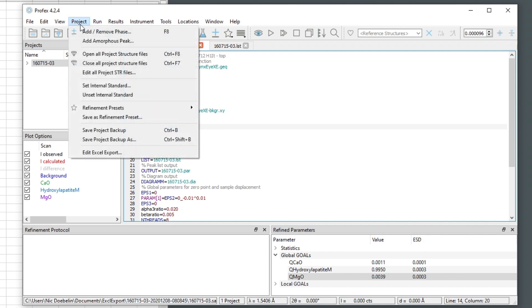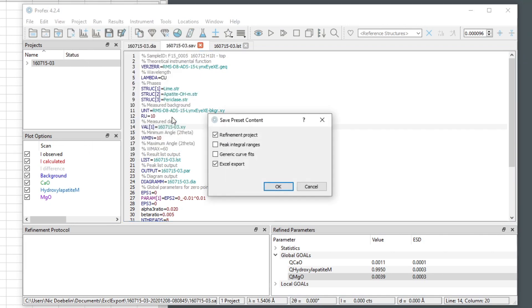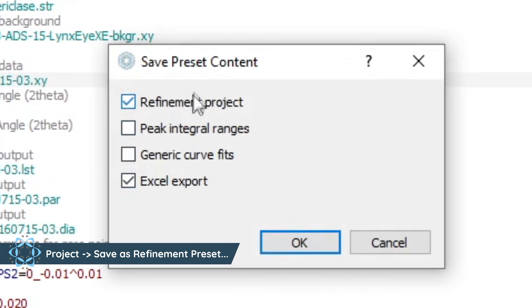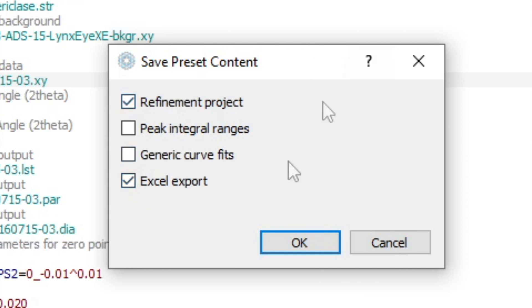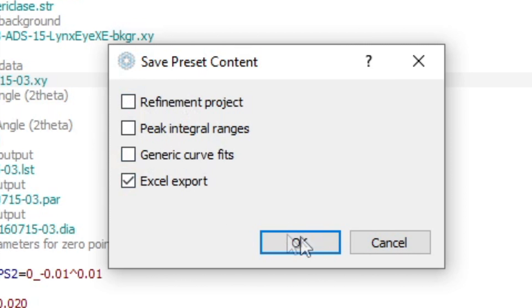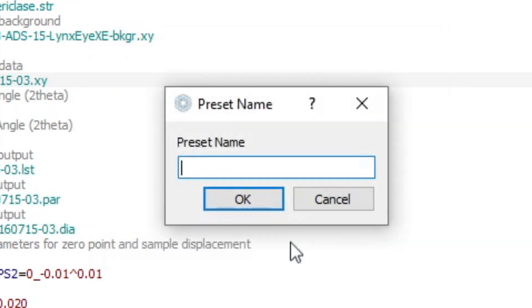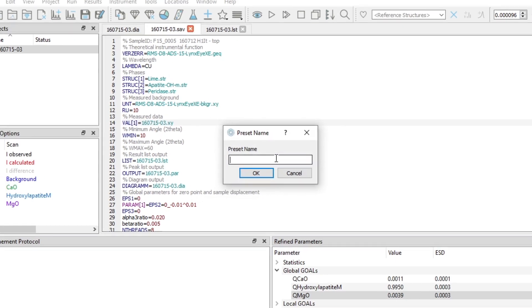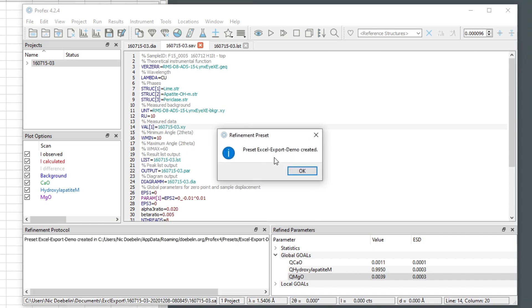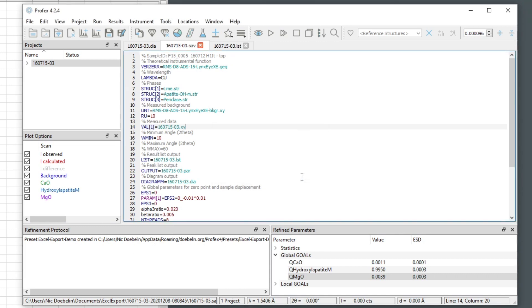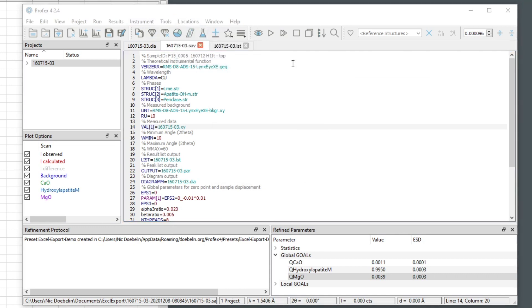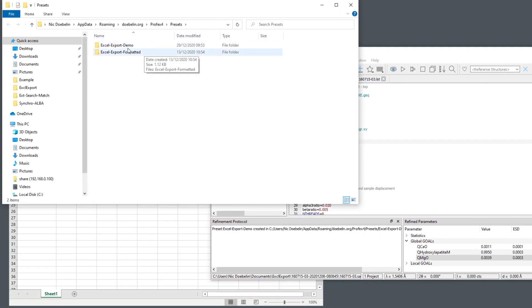So we go to project and select save as refinement preset. And now we can choose to only save the Excel export configuration to a new preset. Or we could also save it together with the refinement configuration in the same preset. But now for this demonstration, we only choose the Excel export. OK. And then I give it a name. And it will tell us that the new preset was saved in our personal preset directory, which we can always access from the locations menu here. So this is the new preset we created.